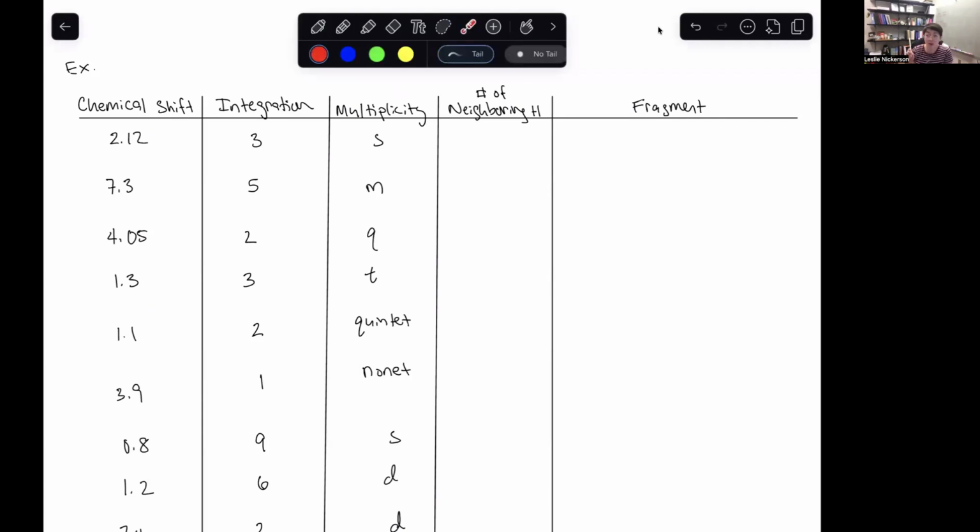I'm also going to be using what I have in terms of chemical shift out of my head. If you're using the tables for this, that is totally fine. And if you're using this video as practice, I would recommend getting your spectral reference tables out now because they will help you identify what kind of areas our chemical shifts are in. But just to avoid a lot of flipping back and forth, I'm going to do it based on what I know.